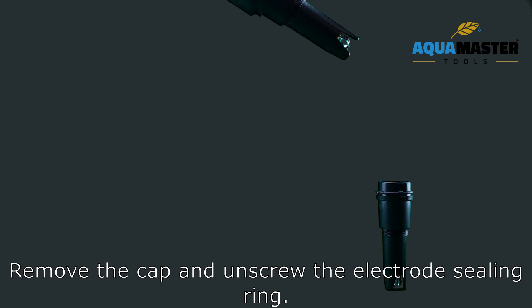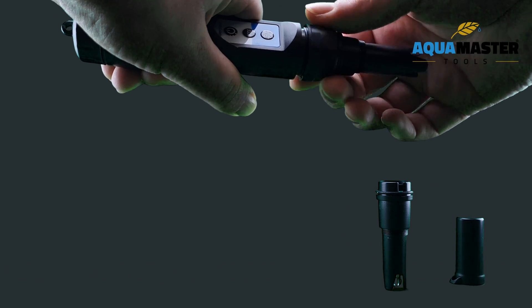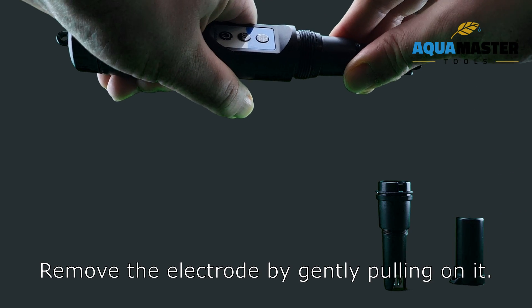Remove the cap and unscrew the electrode sealing ring. Remove the electrode by gently pulling on it.